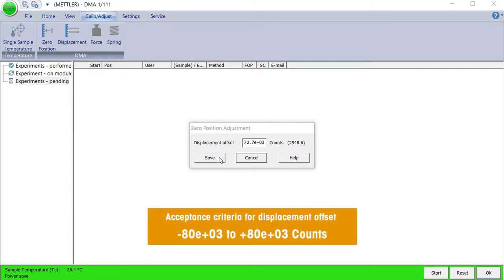If the calculated displacement offset parameter is within the tolerance limits, click Save to adjust the instrument. Otherwise, discard the calculated parameter value by clicking Cancel.